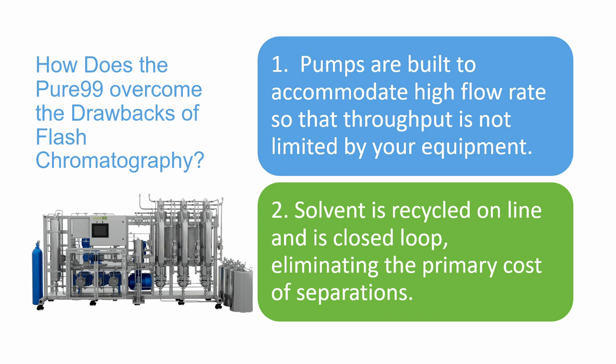Yeah, well, that's what we were doing with our particular one. We had a little tiny bit of THC and a lot of CBD, so we were doing it fast. Gotcha. Yeah, that's cool. But that's a normal situation. With our particular eluent composition, or solvent composition, if you change the composition, it would change the recycle flow rate. Gotcha. Okay, so if I used a different one, I'd have to change the temperature.